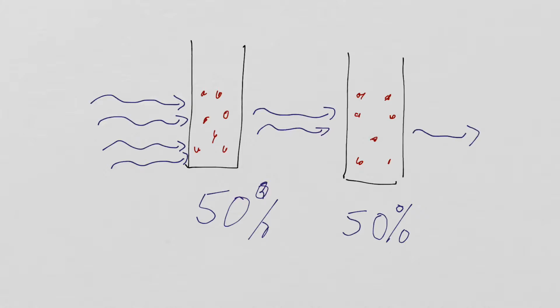And that is actually what happens. So the amount of light that goes through depends on how many containers I have, basically.